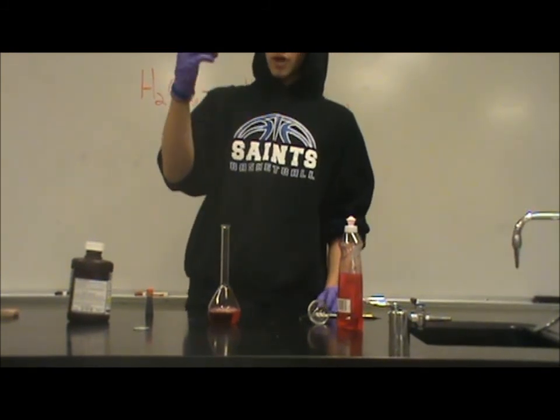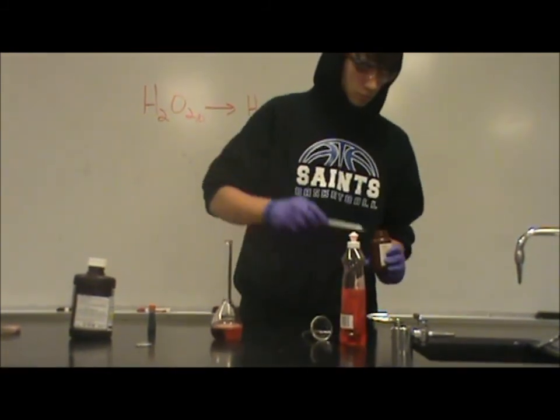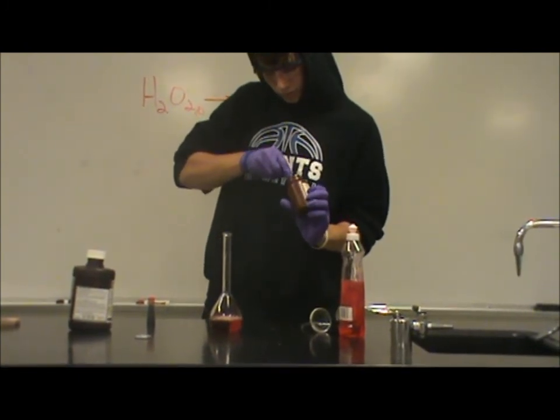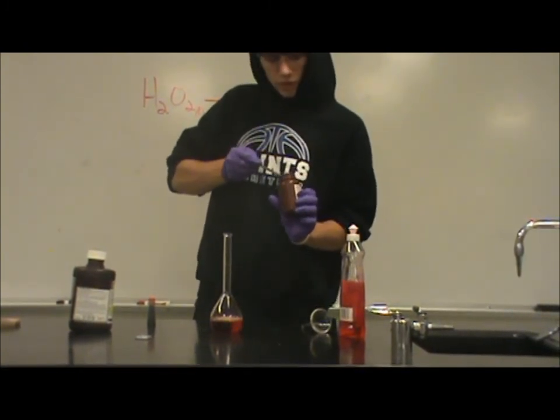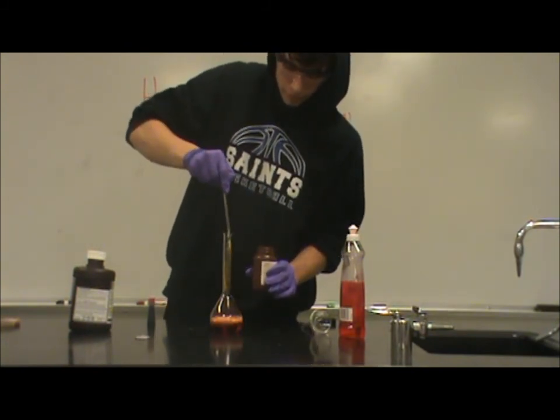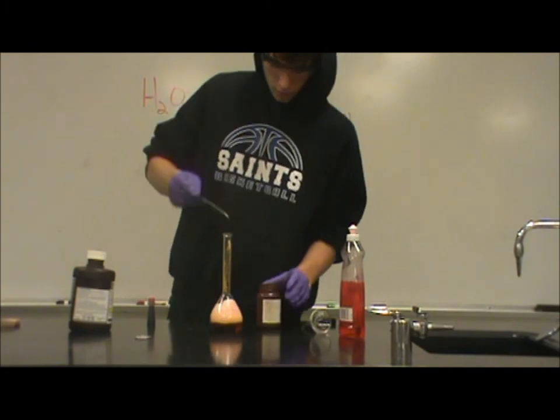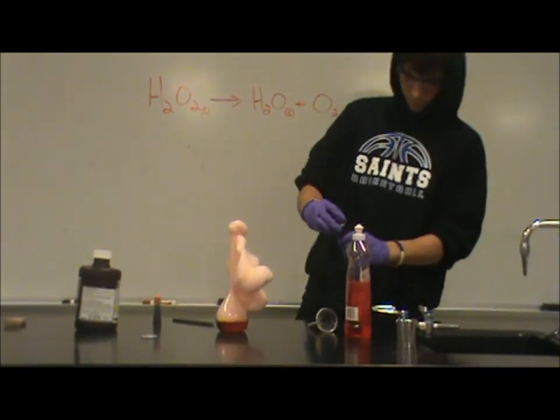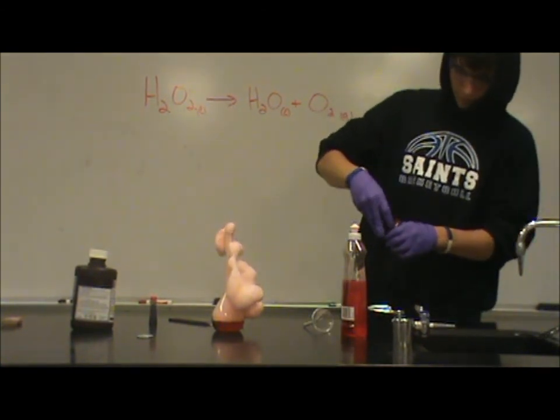Now, your sodium iodide — you're going to need a little scoop. Okay, that's good. Get in there. And now have your toothpaste.